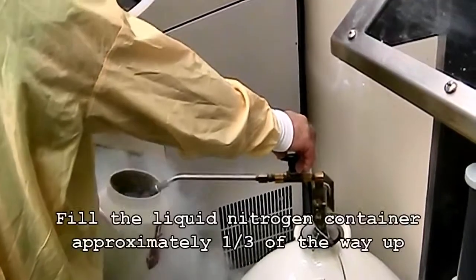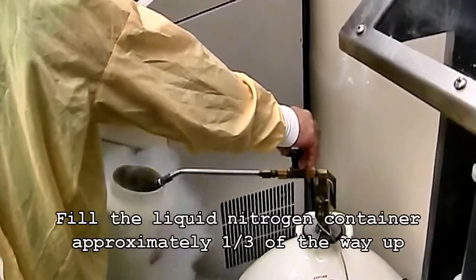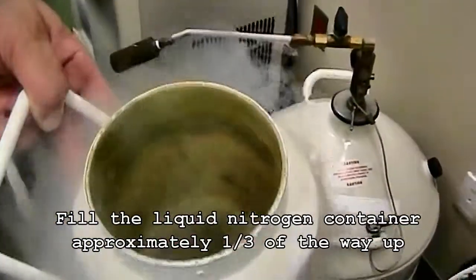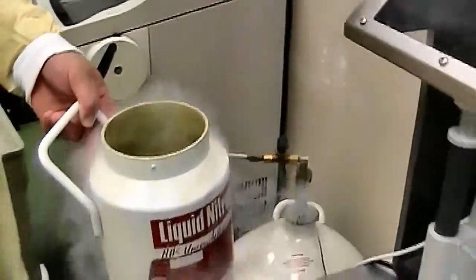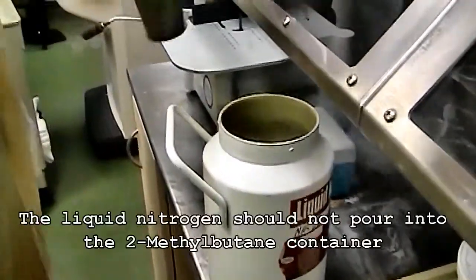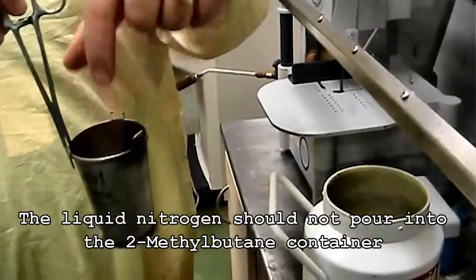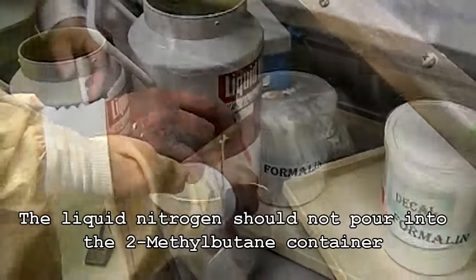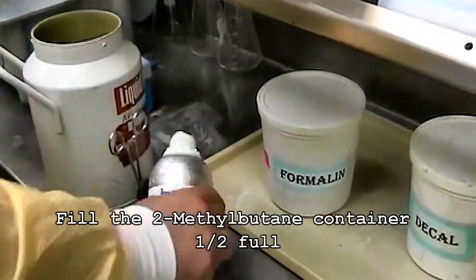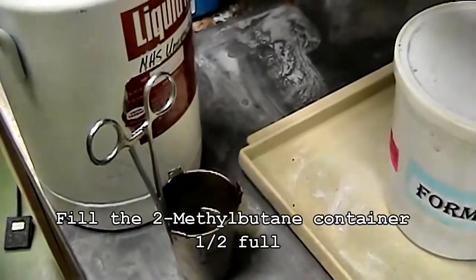You gotta put a little more in than you normally need because it has to start the cooling process. You're gonna lose some of it in the cooling process. That's probably too much. Okay. We're just going to let it dissipate for a while, though. Because the reason why is you want this to be able to sit down in there without the liquid nitrogen to come into the 2-methylbutane. About half full.